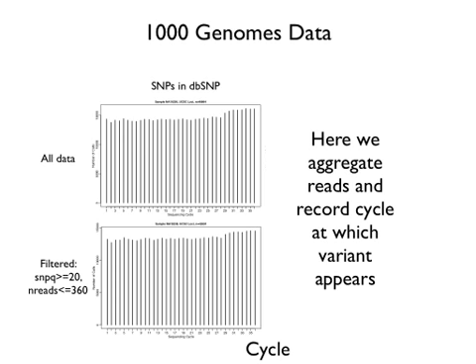We take all the SNPs they call, and we divide them into two groups: the SNPs that are already known, that's in dbSNP, meaning it was already in a database, and the ones that are novel.